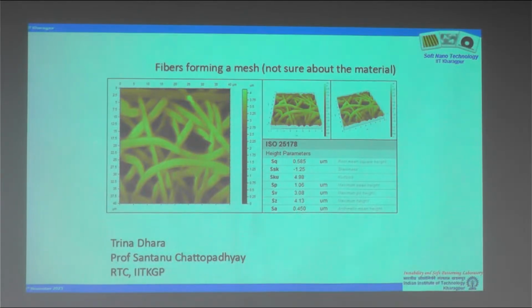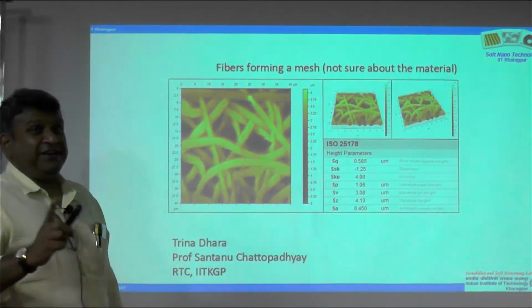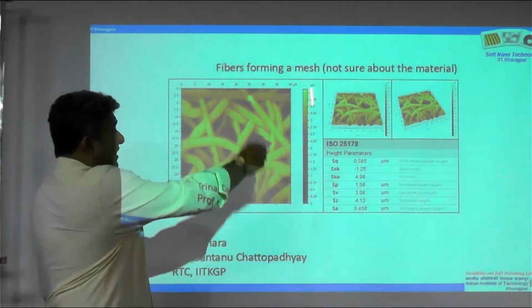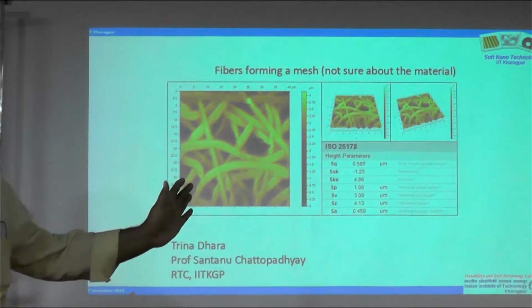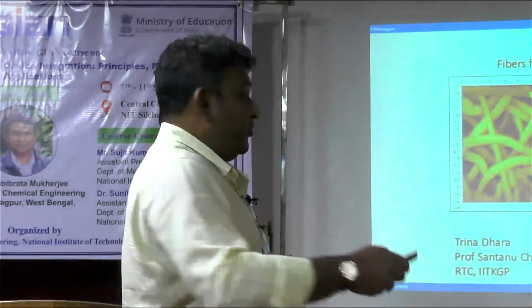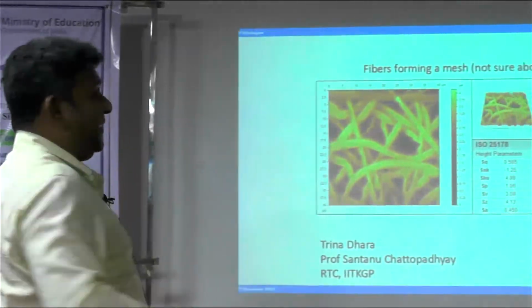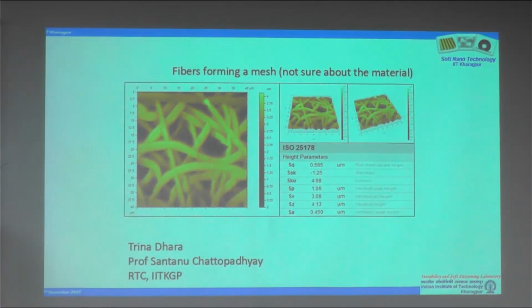And now, as knowledgeable folks, whichever class I teach, I always tell them, you are knowledgeable folks. So you are also knowledgeable folks now. If somebody shows you an AFM picture which is only limited to this, immediately point out, this is missing and I don't accept. Because otherwise, whatever you see on the left side is a major part of the picture, but that any microscope will give you. It is only this part that atomic force microscope only can give and nothing else can give. I hope you all understand the vertical scale bar.